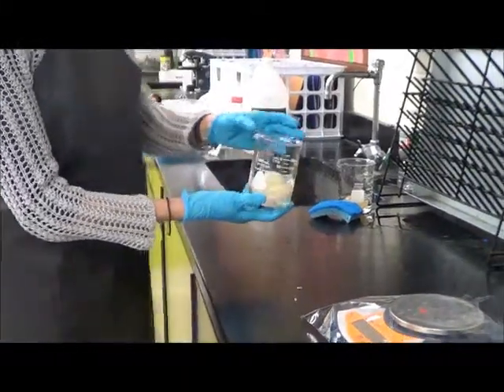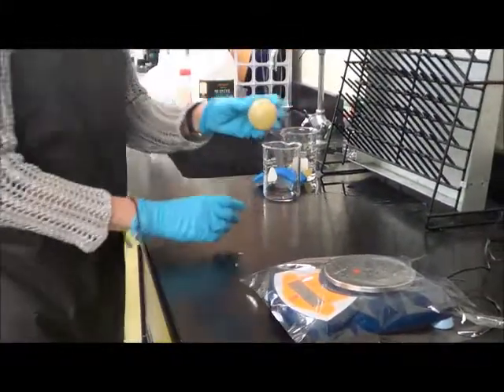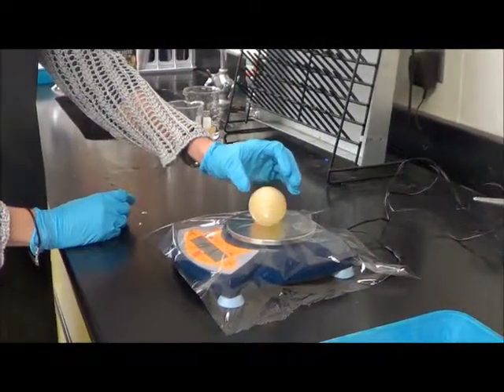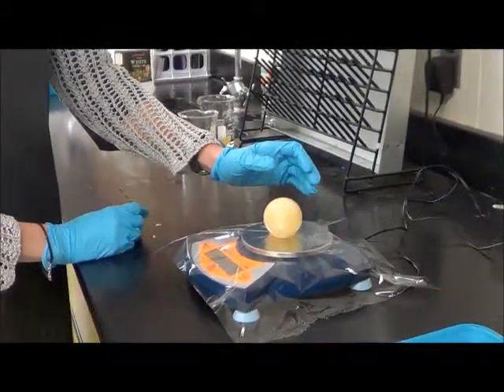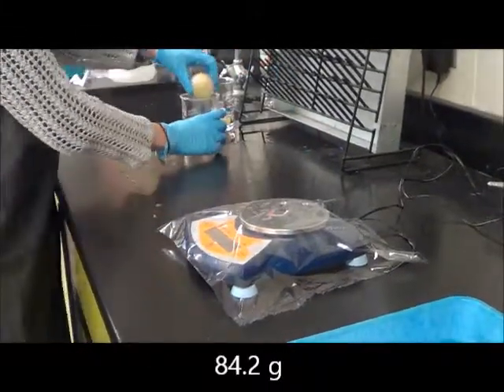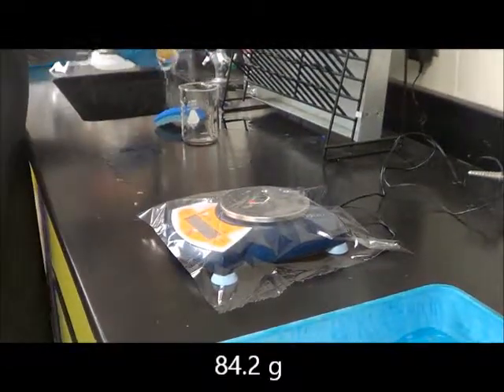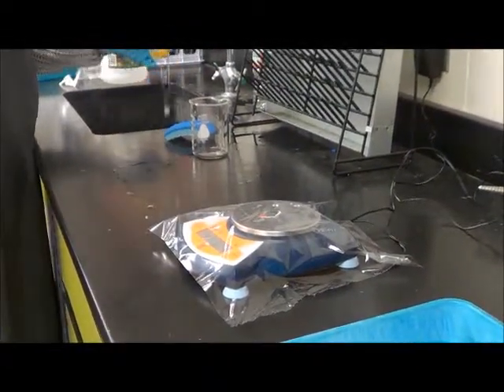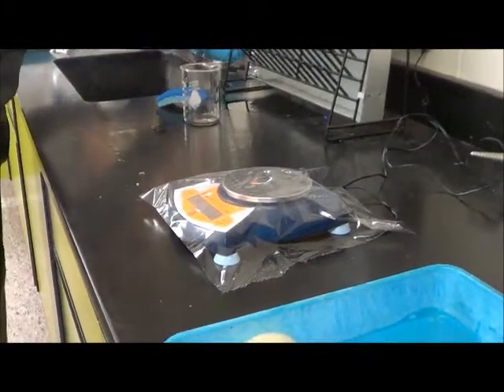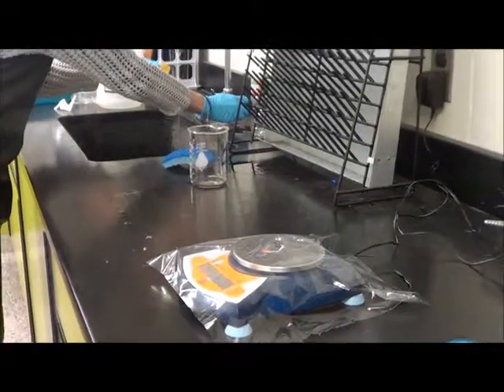I'm here with the egg. This one was in distilled water, so we're going to weigh it. This one weighs 84.23 grams. Then this one was in the corn syrup. Very gently rinse it out.